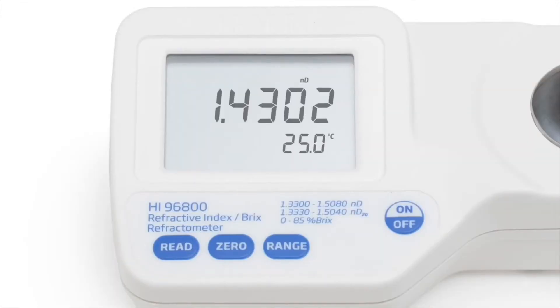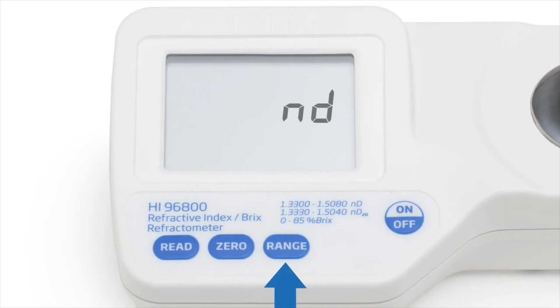The reading will be displayed on the large, dual-level LCD within a few seconds along with the temperature. The range key can be used to switch between temperature-compensated, non-temperature-compensated, and percent Brix readings.